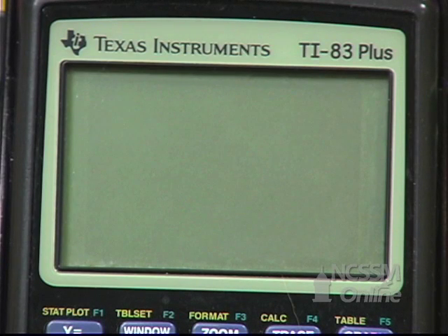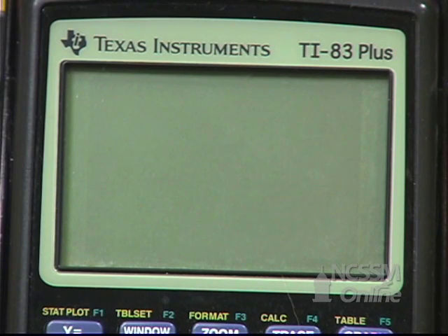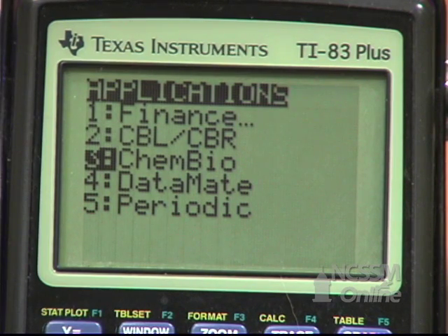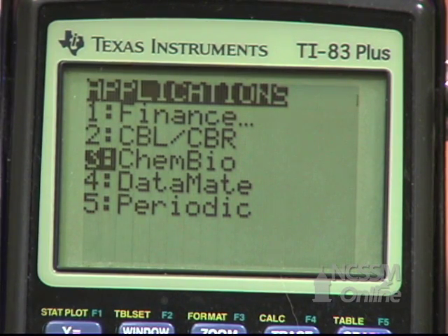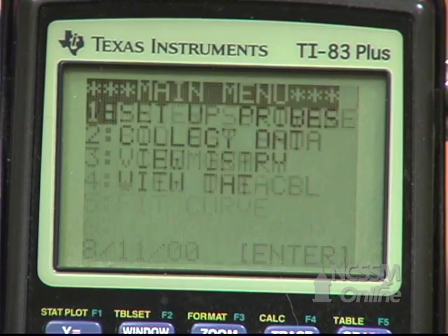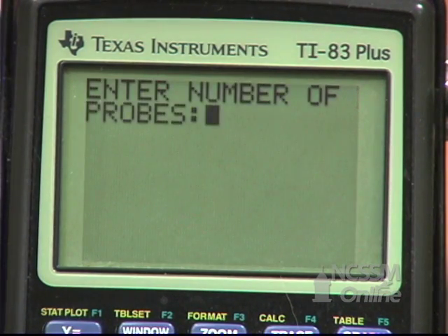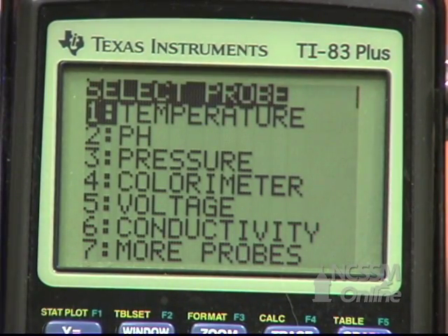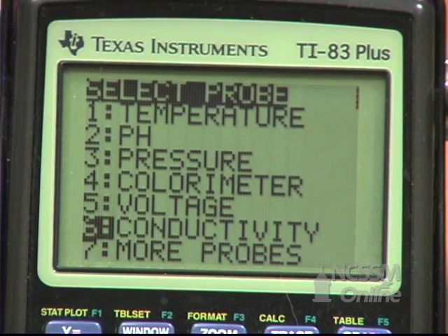We're going to calibrate a CBL conductivity probe. To start out, press Apps on your calculator, select ChemBio, press Enter, go to Setup Probes, select the number of probes, type of probe, and select Conductivity.